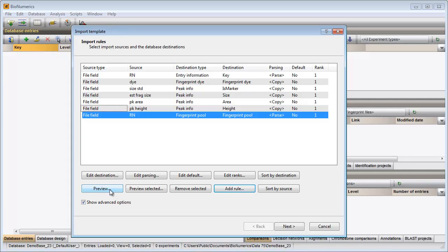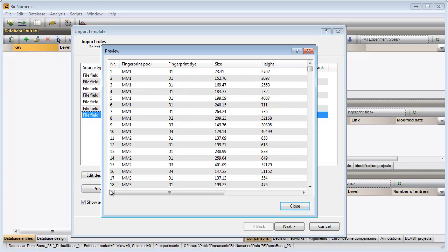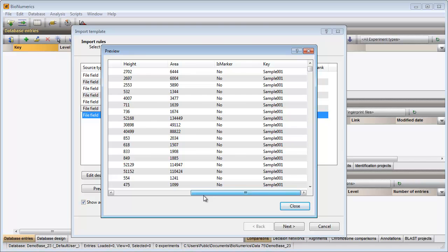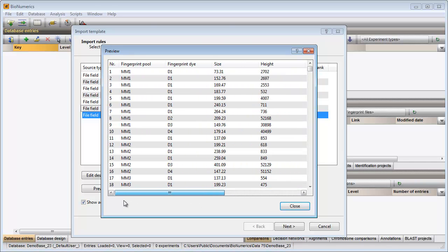When I press the preview button again, I can check all rules that I have defined so far. From the preview I can see that all information is correctly parsed from the peak table file.